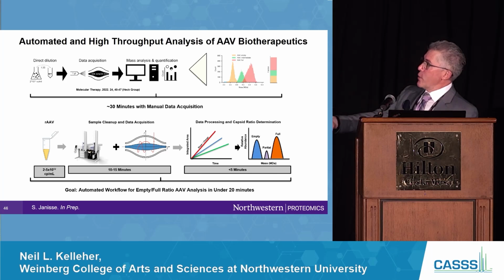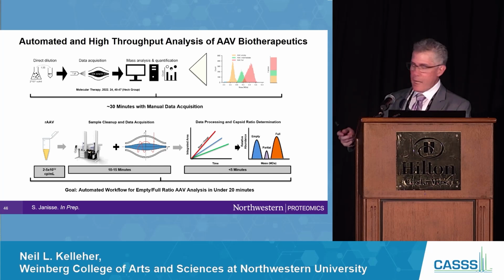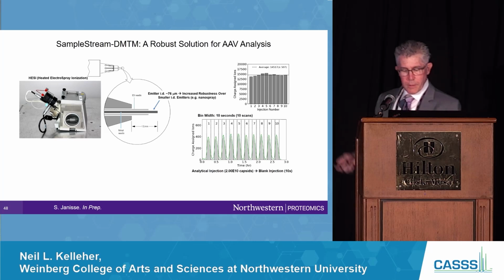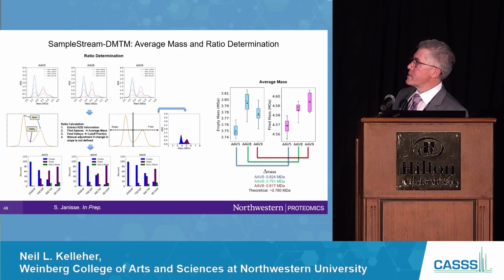So yeah, UHMR sample stream. The methods might take a month or so to get this kind of consistency, where that's a different sample. And he's done 100 of these in a row, and that'll be in the paper.